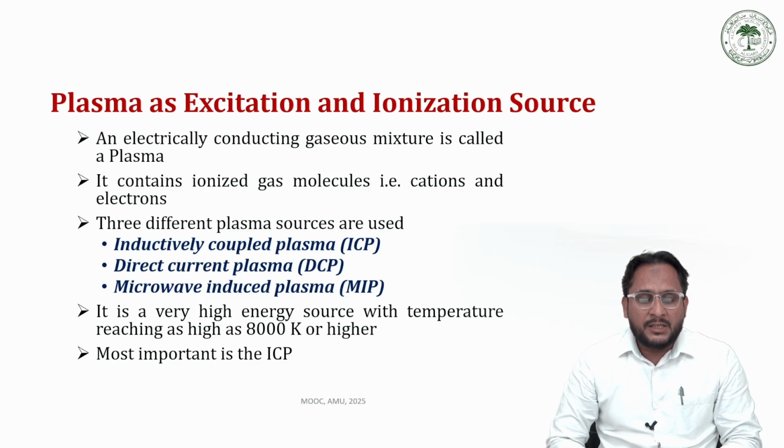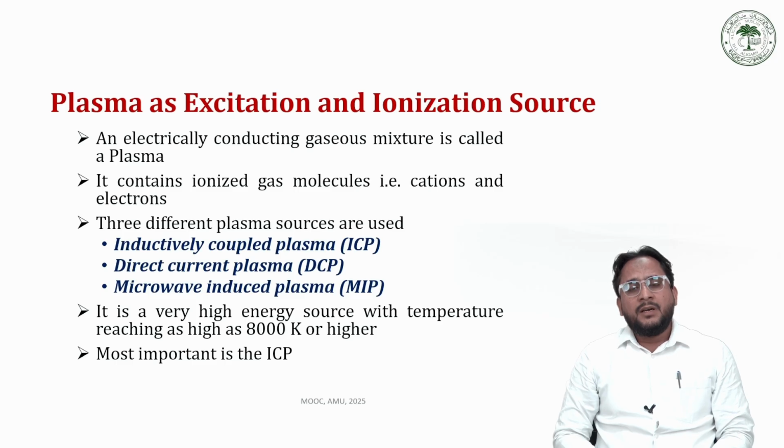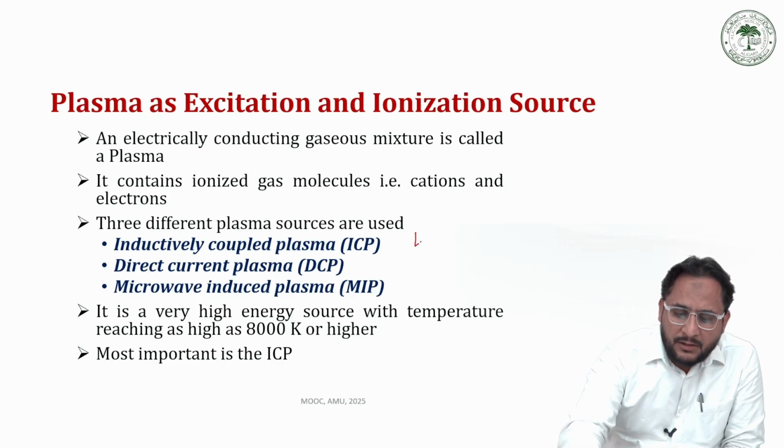Then comes the plasma as an excitation source or ionization source. So before moving on to plasma, I should ask, what is a plasma? Do you know what a plasma is? A plasma is also known as the fourth state of matter.